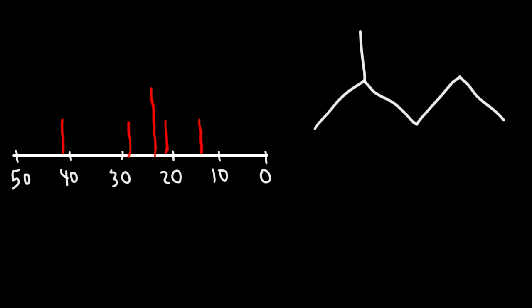Now in this example, we have 2-methylpentane. So go ahead and assign the carbon atoms to the chemical shifts that we see in the spectrum. First, let's identify the carbon atoms. These two methyl groups are equivalent to each other, so we'll call it carbon A, and then B, C, D, and E. Automatically, because there are two methyl groups corresponding to signal A, we know it's going to be the tallest peak. So it's going to have a chemical shift of approximately 23.